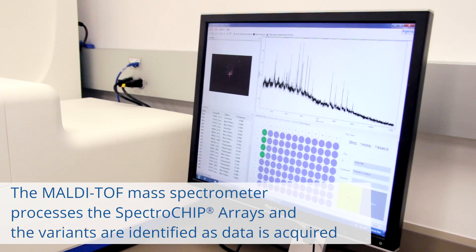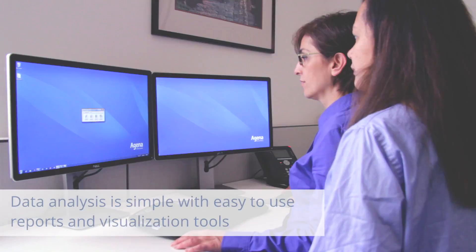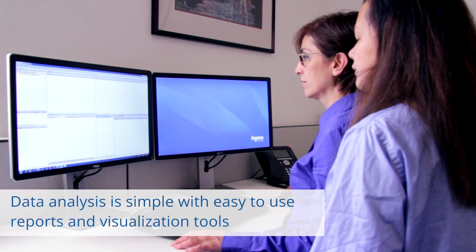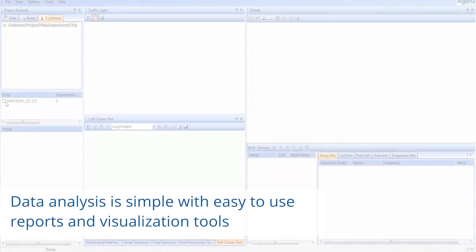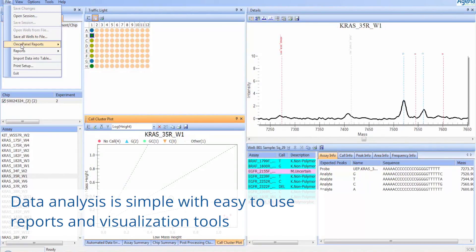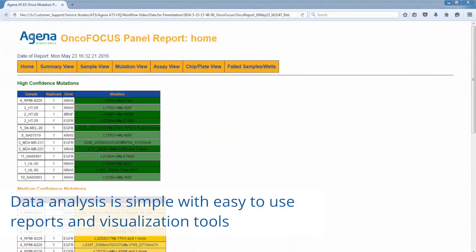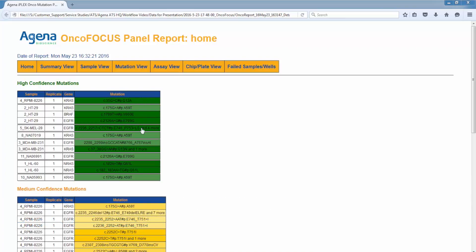Calibration and analyte mass analysis begins once the SpectroCHIPs are loaded. Run progression can be monitored in real time as data is acquired. After all results have been acquired, Typer analyzer produces easy-to-read spectra that identify alleles by expected and observed mass. Data can be visualized as traffic lights, cluster plots, and histograms. Results can be exported into reports or stored for later use in the MassARRAY database.